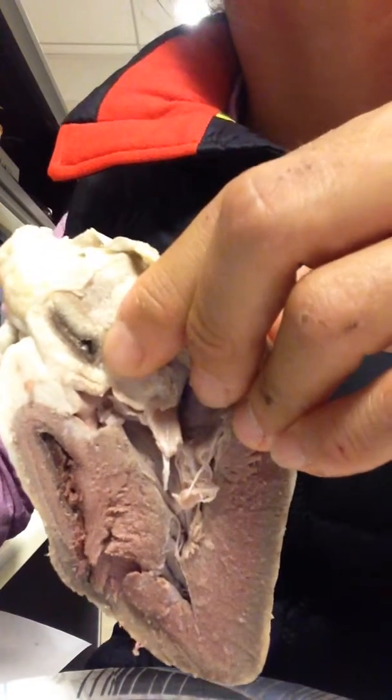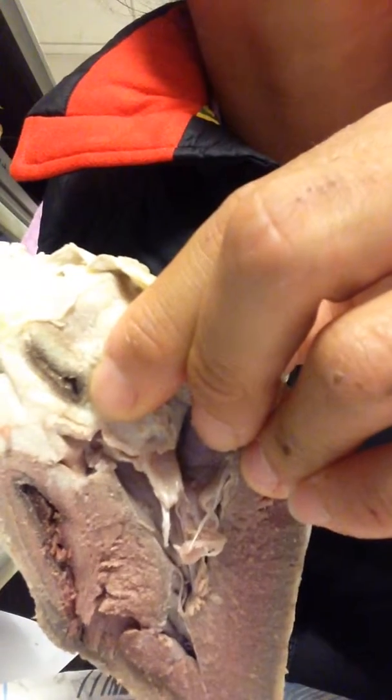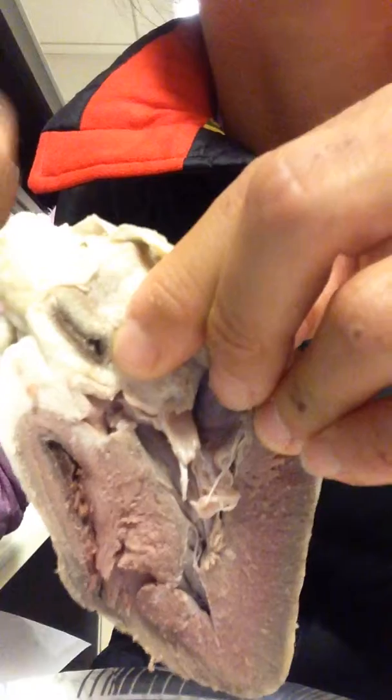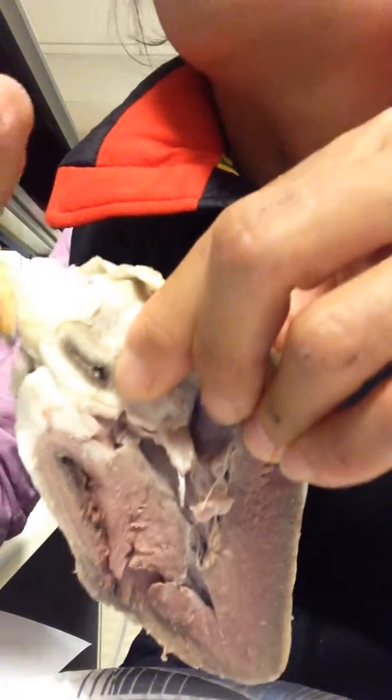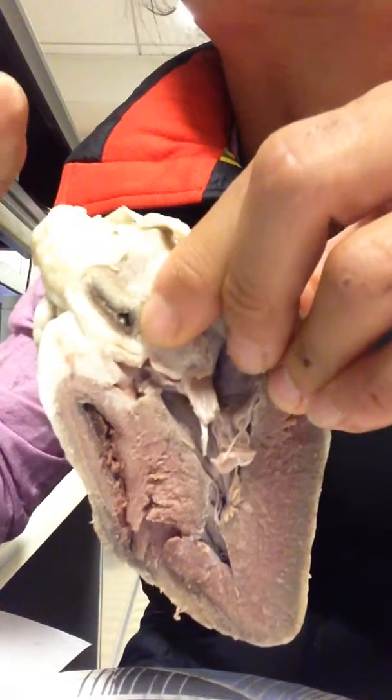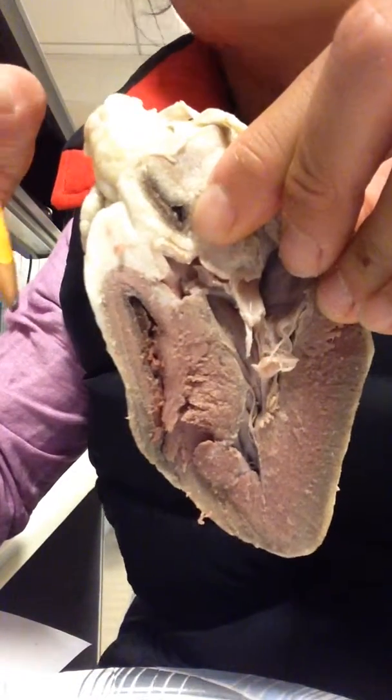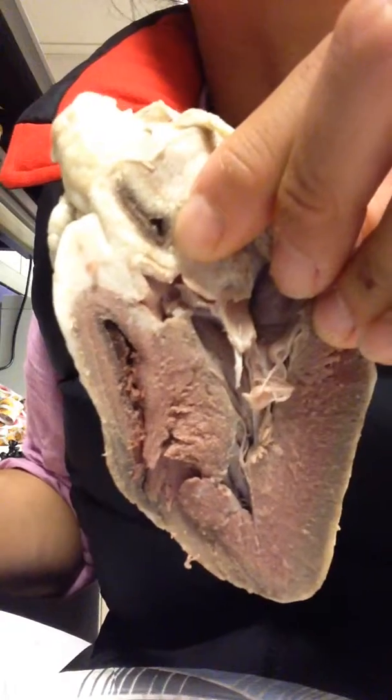And then, why is the myocardium of the left ventricle three times thicker than that of the right? So the left side is thicker and bigger because it pumps blood through the entire body, whereas the right side only pumps blood to the lungs. So there's essentially more pressure applied to the area, and therefore it is a lot thicker than the right side.